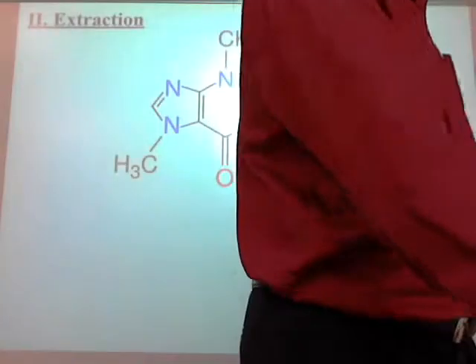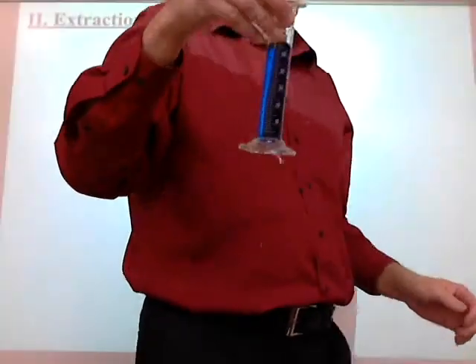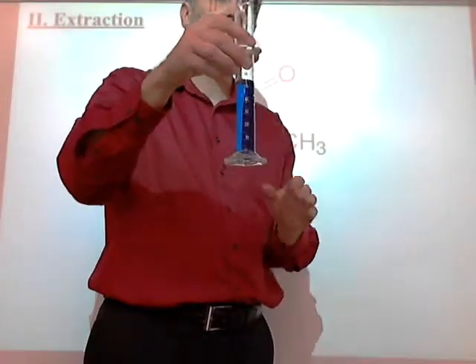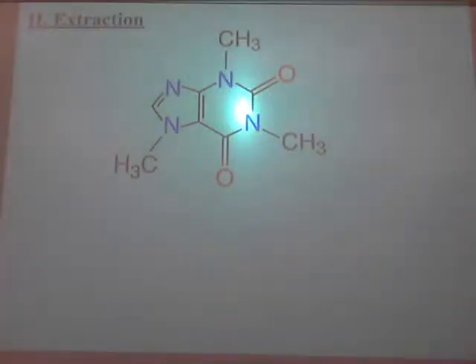All right, and then if I add water to it, you'll see how strong of a dye this is. I mean, it's a very deep blue purple. From just a few drops of that dye, it turns very deep blue. All right, now that's what you see here.